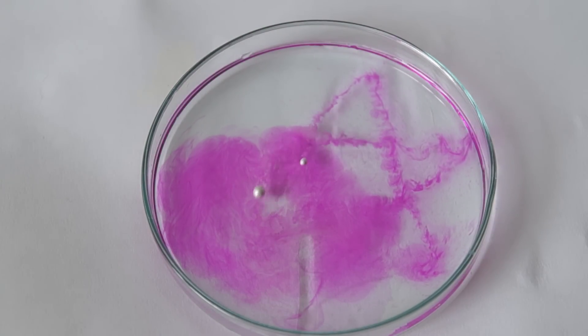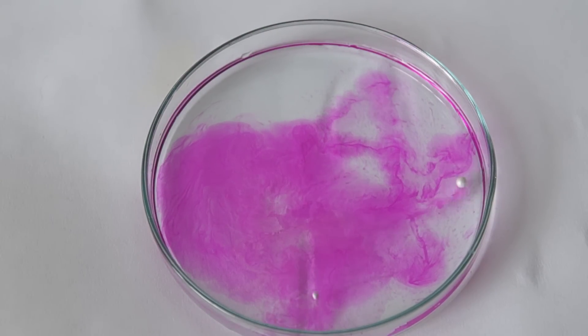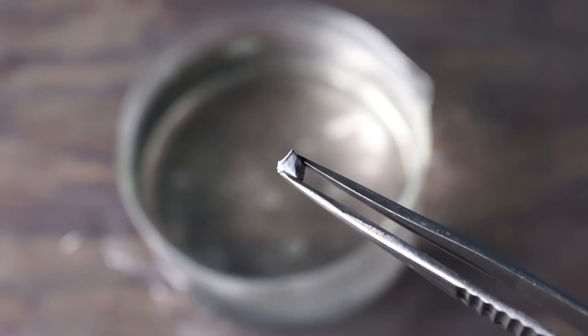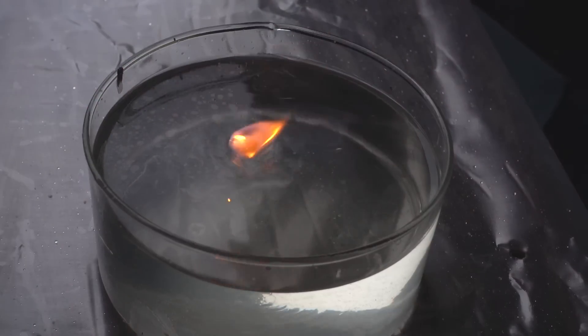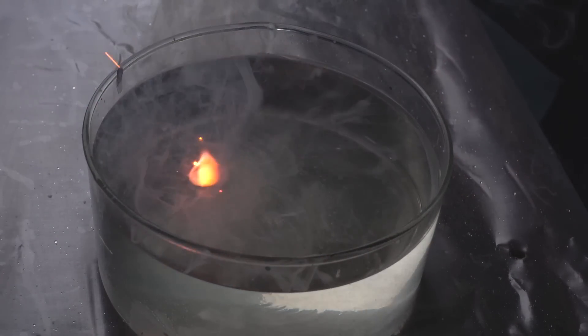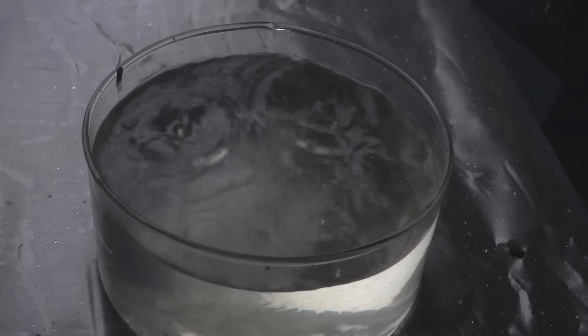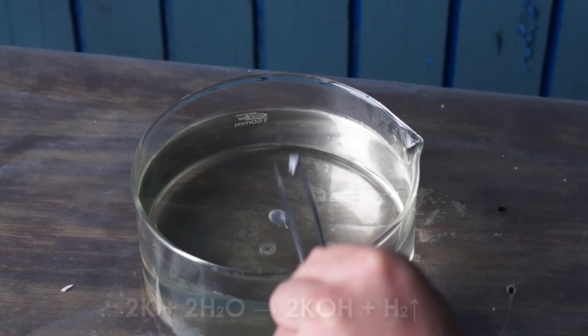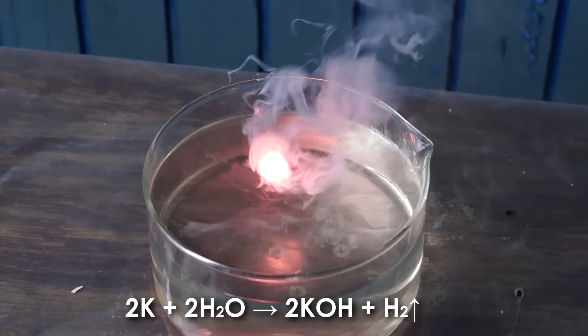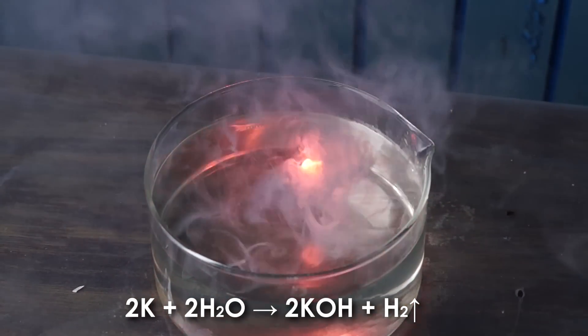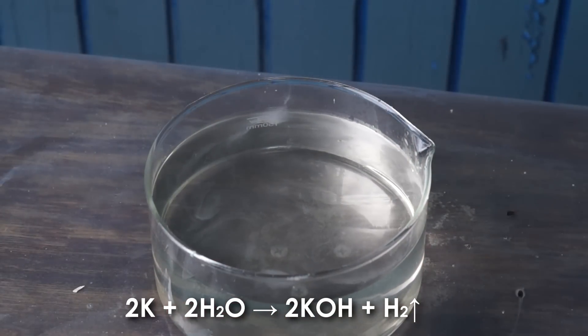So if small pieces of sodium react with water more or less calmly, even small pieces of potassium immediately ignite and explode spontaneously. The reaction of potassium and water produces alkali and hydrogen is released which burns with pink flames due to potassium ions.